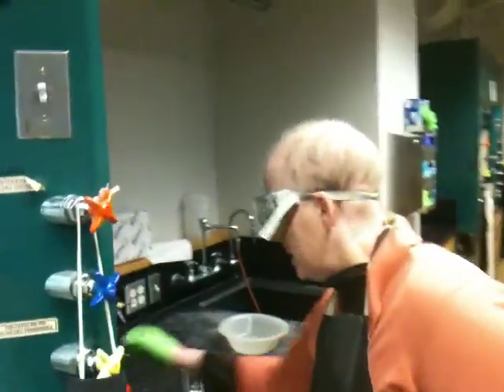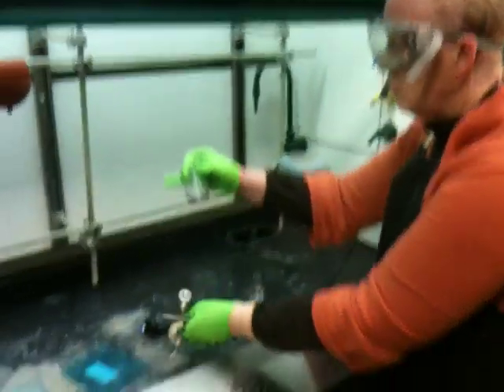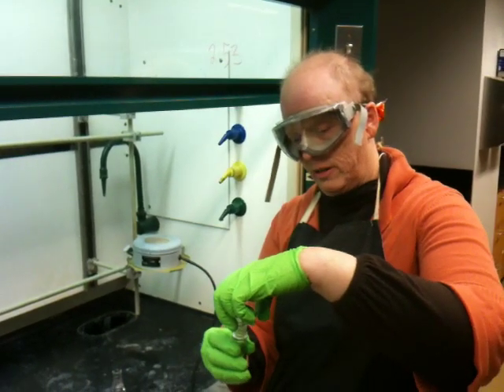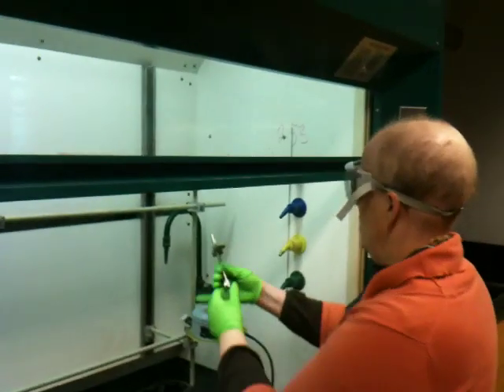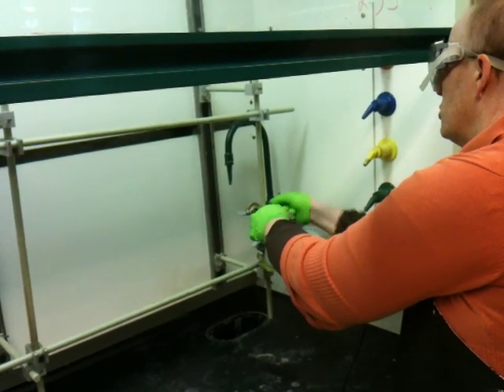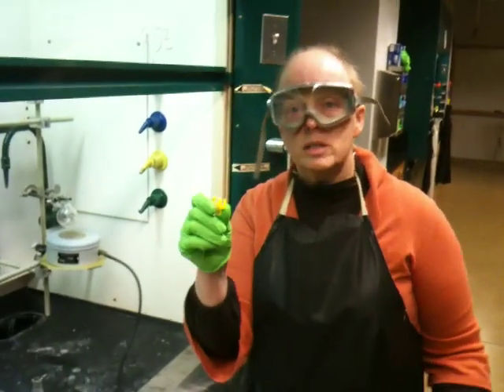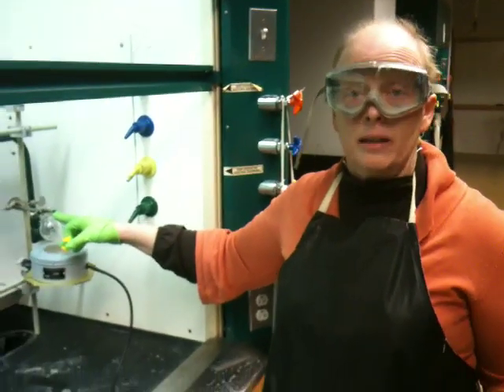Next in the apparatus — I'm showing you proper still building. You take the round bottom that you're going to distill from and put one or two boiling stones in the bottom. Then clamp that round bottom to the monkey bar. Students tend to fall in love with these little clips over the course of a year and start to think the whole still can be held together with them. They are really weak and break easily. You must have a clamp on the bottom of your apparatus. I'm going to show you exactly where to put clamps and exactly where to put clips.